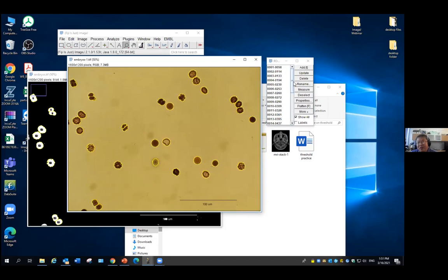For all those 30-cell embryos, we may have some problem. We may count one more in one image and one less in another image. I will just take it. I'm not a very high standard guy. What I care about is not the perfect method for this image, but that this protocol can apply to the majority of my images like this.